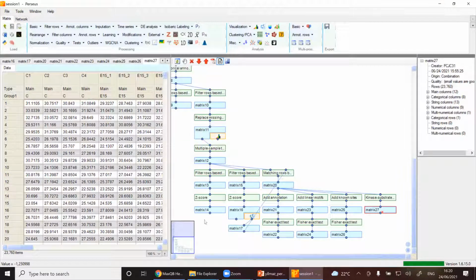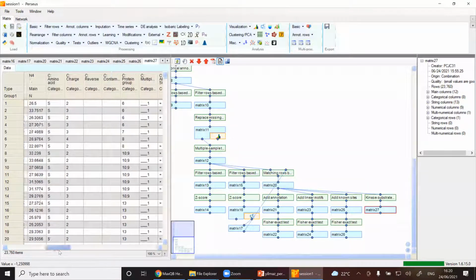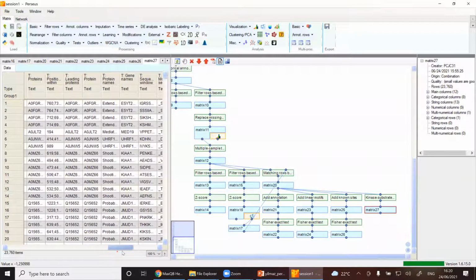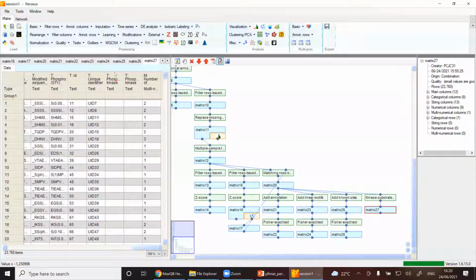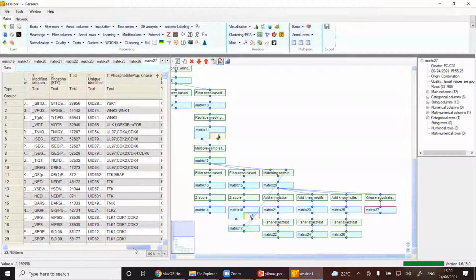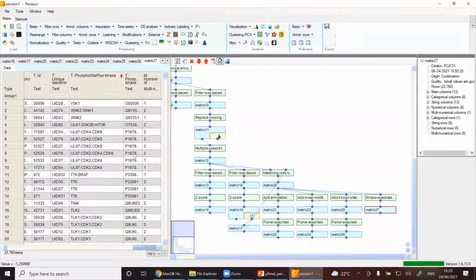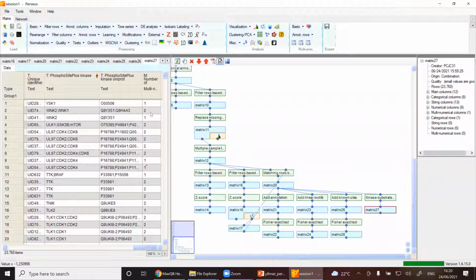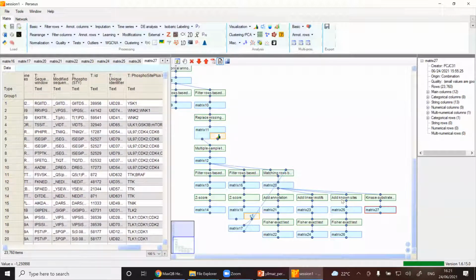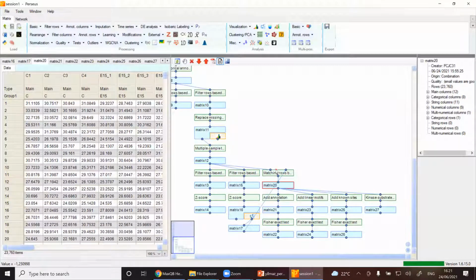And then on this kinase substrate, if we go, there will be some more information about this PhosphoSitePlus kinase. So, okay, this has been known on PhosphoSitePlus, and there's a bit more information. What about this UniProt ID? So PhosphoSitePlus already gives you a hint about the UniProt where you could go, and the number of phosphorylation sites that have been there.